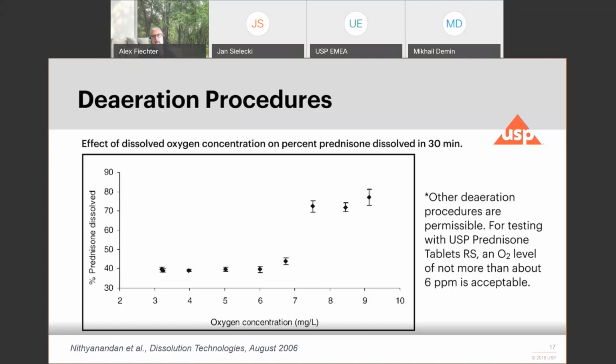As soon as the ppm level of dissolved oxygen is going above 6, you will not only see much higher results, but the variation of these results are much higher. So a medium non-degassed with prednisone will give you between 70 and 80% released after 30 minutes, which is double the result. So no wonder why it is critical to do the medium deaeration here.